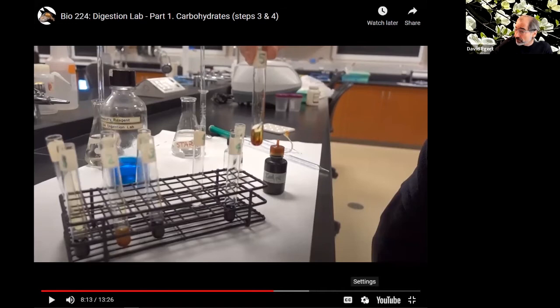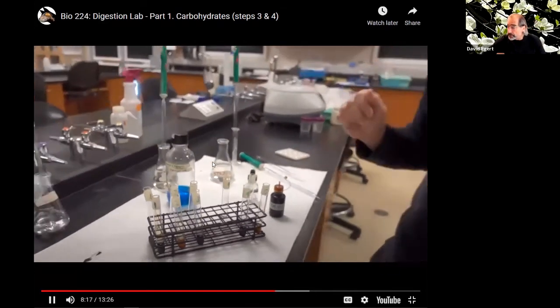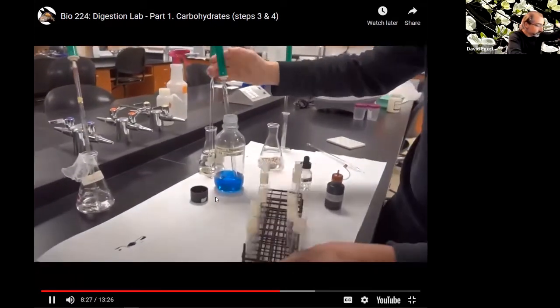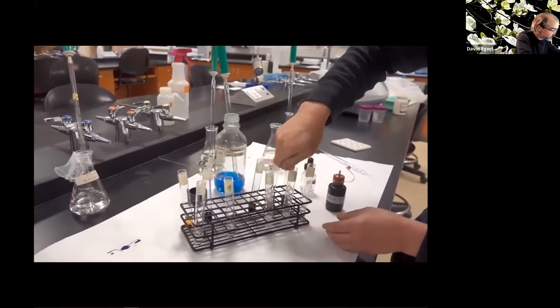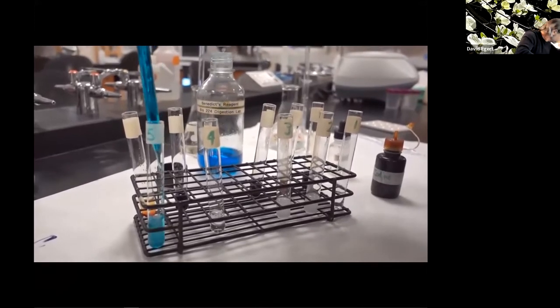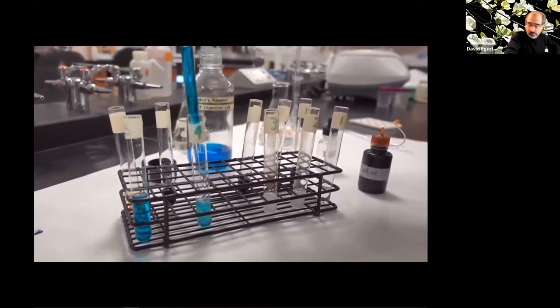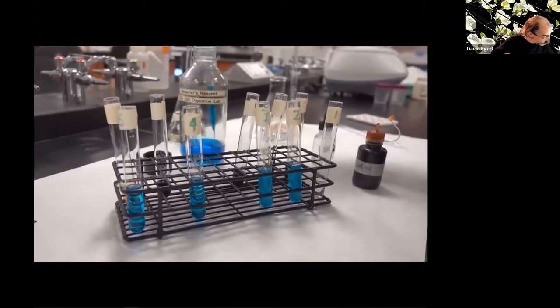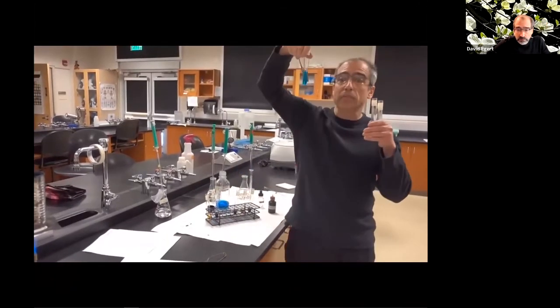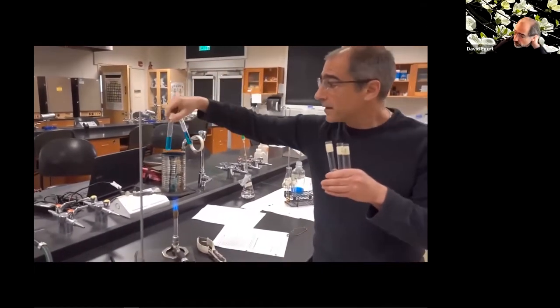And again, I'm going to run this through fast since you can just see it quickly. Maltose is showing negative. To do the maltose test, we have to add 4 mLs of Benedict's solution into each of our other tubes. So now, again, for each tube, let's do this up. There's 4 in there, 4 in there, and finally 4. All right, so now each of these is going to have to get boiled for 2 minutes. So let's put these in.